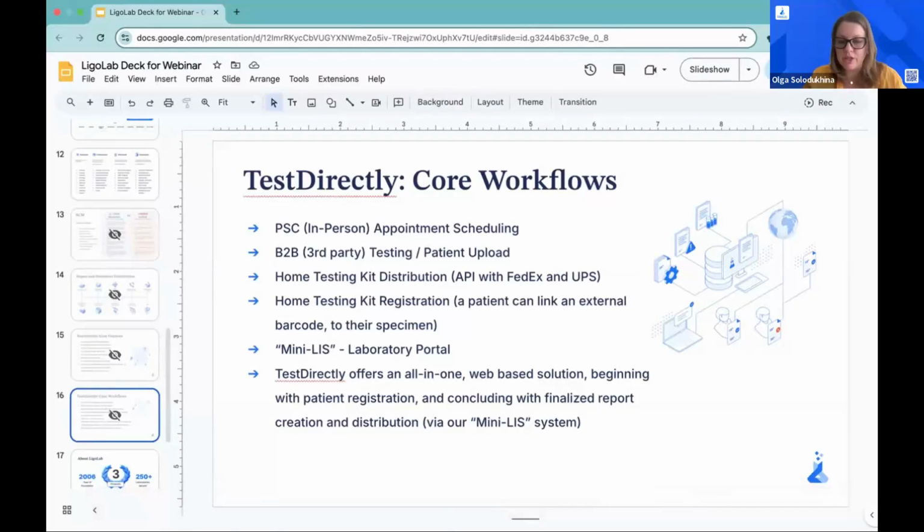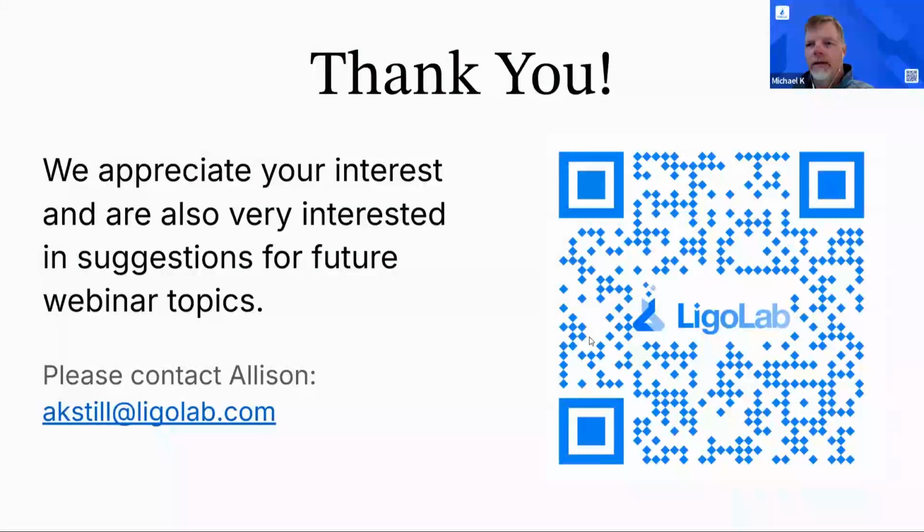The process will be essentially the same. We'll meet you for the discovery, finding out what you really need and how we can help, and then dive into the demonstration. Test Directly was quite useful and very successful for many labs during the COVID pandemic. It was basically developed as that pandemic started. Of course, now it can be utilized for any form of direct-to-consumer diagnostic testing. In fact, we have webinars about that in our webinar archive.